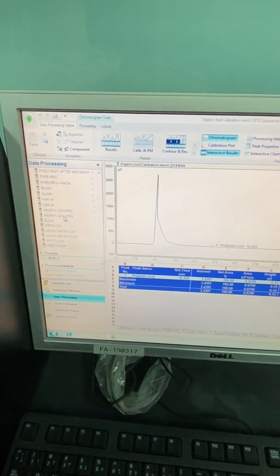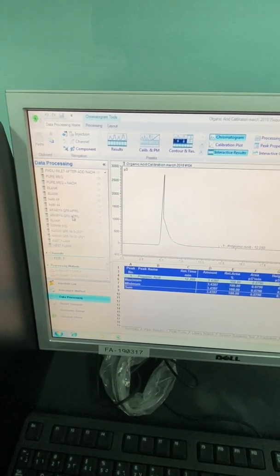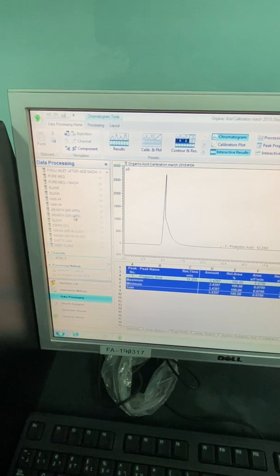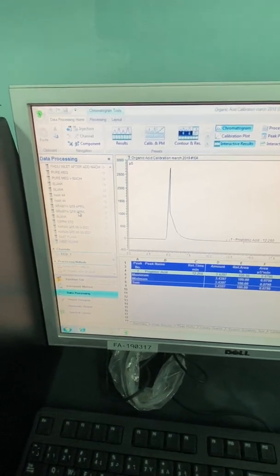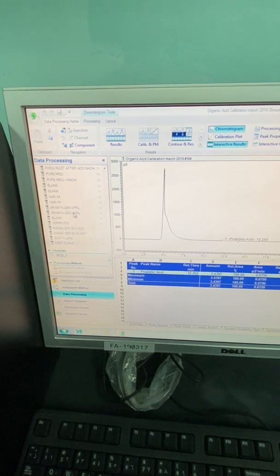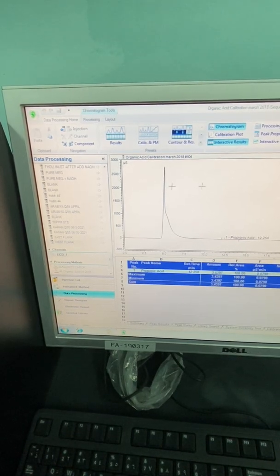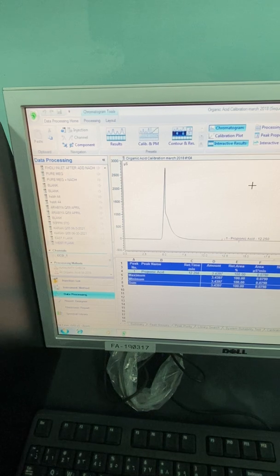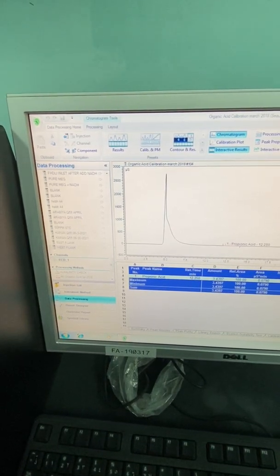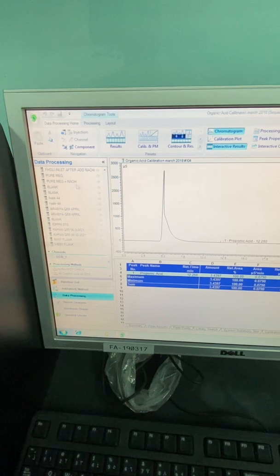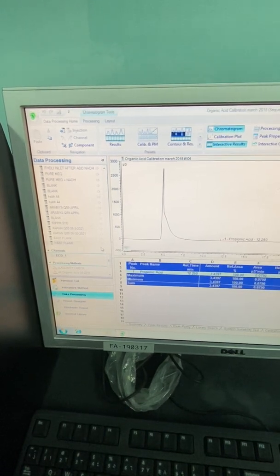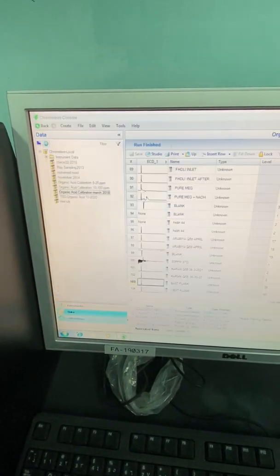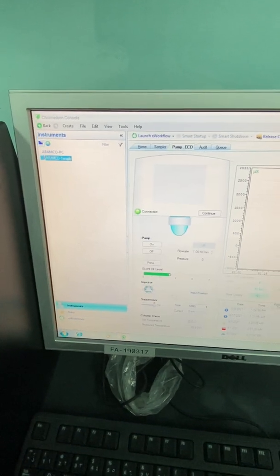As-salamu alaykum. My name is Dr. Mohamad Mahmoud. Today I will try to explain the software for the Chromeleon for the ion chromatography analyzers. This one for Thermo. I will try to just give you a brief for how to use the software, how to inject a sample, how to do calibration.